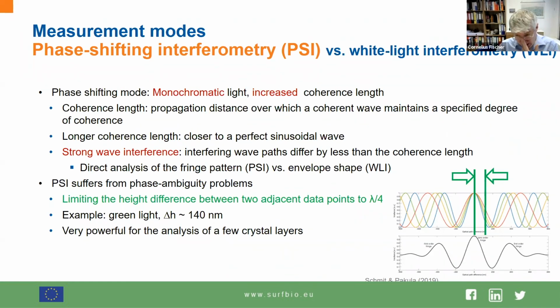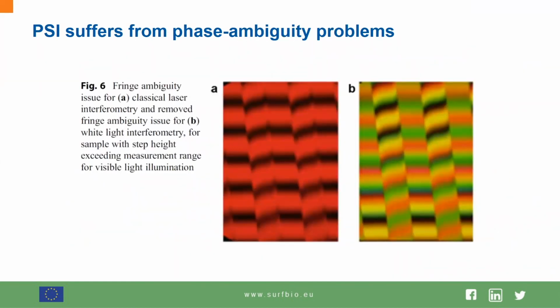For several applications, this limited height range analysis is still sufficient to come up with very interesting and important data sets. We are working here with a precision that is able to detect height changes of a single crystal layer. That's really something where you can track fundamental changes of solid materials in very high precision. Again, what cannot be done are height modifications that go beyond this height change that refers to a quarter of lambda.